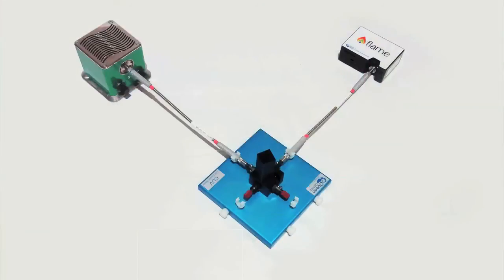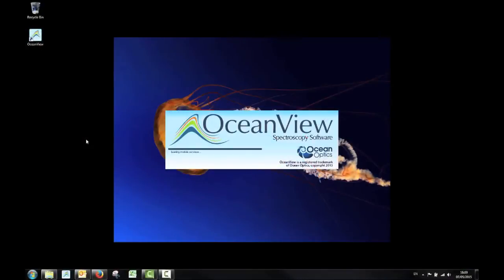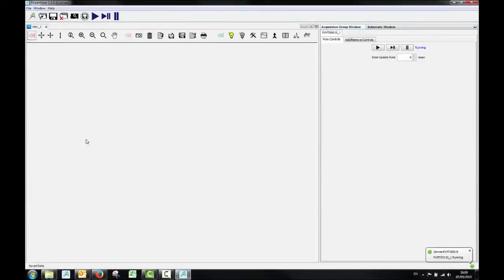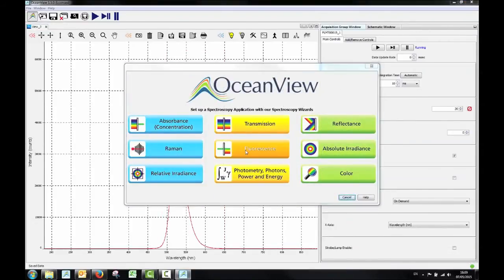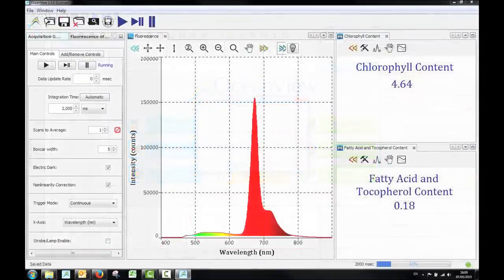Now you are ready to connect your spectrometer to OceanView software to begin collecting data. Look for additional videos demonstrating how to perform fluorescent measurements using OceanView.